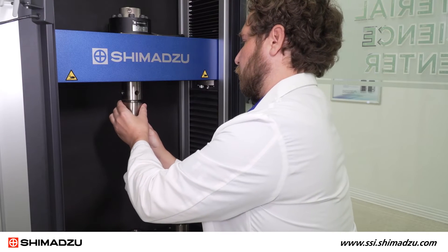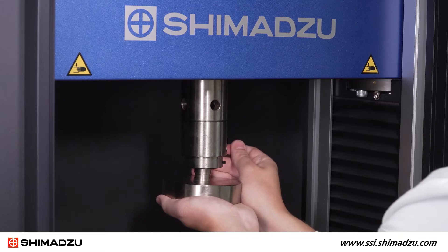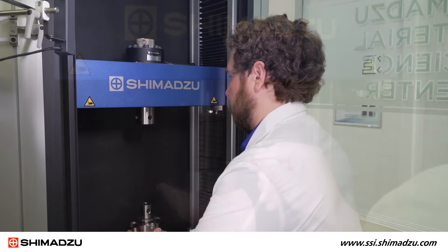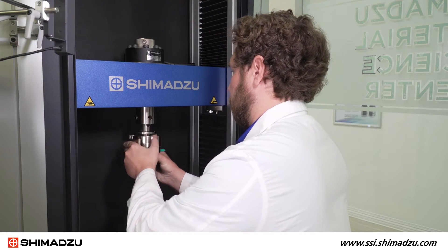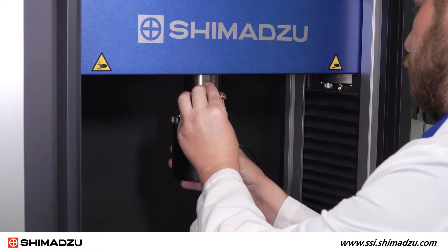The universal adapter can be swapped with a compression adapter and enables the user to perform compression or bending tests. With the use of the load cell adapter, the user can easily test with a lower capacity load cell and get more out of their instrument.